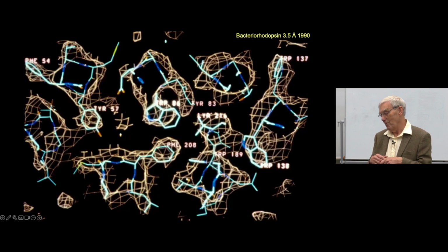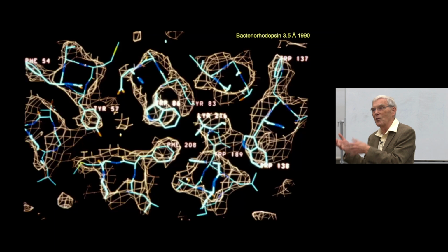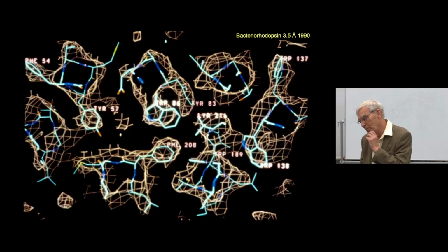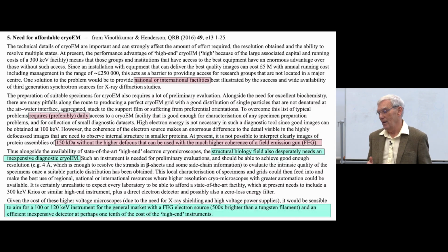So that's what we were doing, and that led me from X-ray into electron crystallography, and eventually into imaging and single particles, no crystals anymore, because it turns out the images you can get are just as good as the diffraction patterns. So probably about 7 or 8 years ago, Vinoth Kumar and I, Vinoth was the one who worked on the mitochondrial complex 1 initially in Cambridge with Judy Hurst's group.